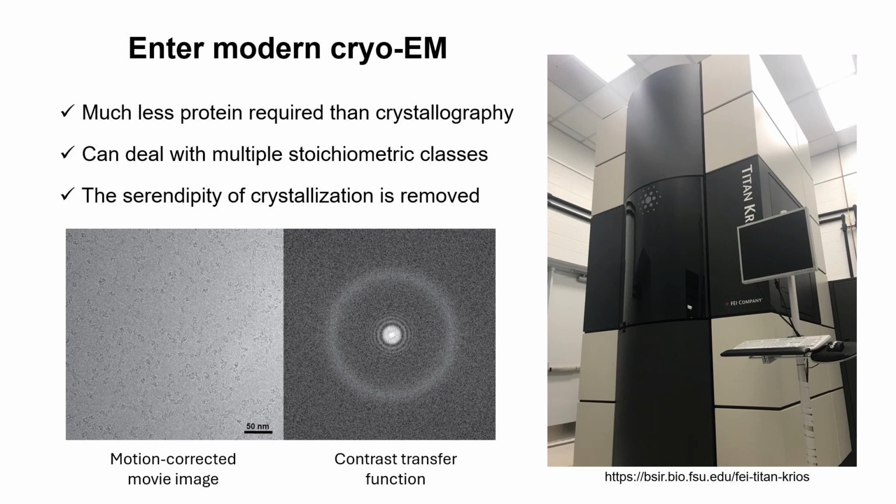What we really wanted to know was what were the conformational changes that occurred in the receptor as a whole upon insulin binding that would bring about the juxtaposition of the tyrosine kinase domains themselves. And it was about this time that modern cryo-EM emerged. It offered us immediately significant advantages, the first of which was we could drastically cut our cost of protein production.